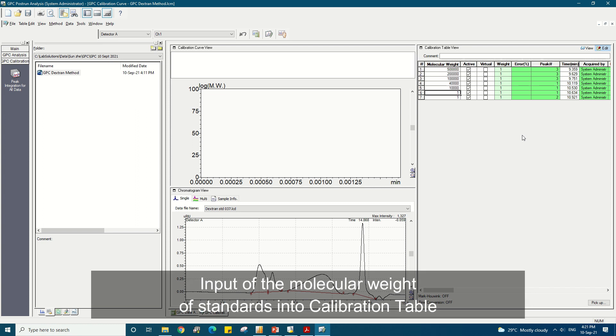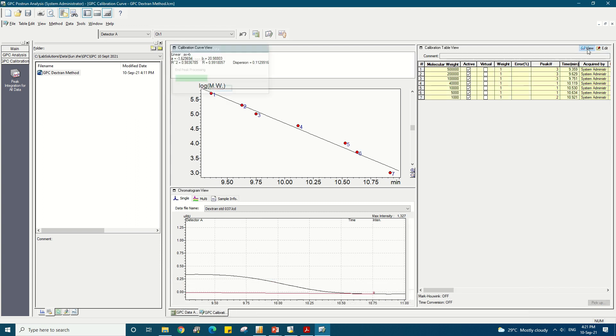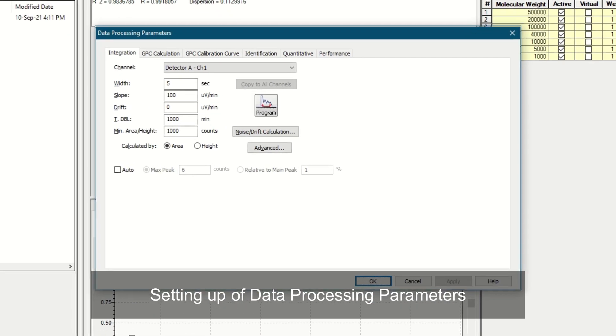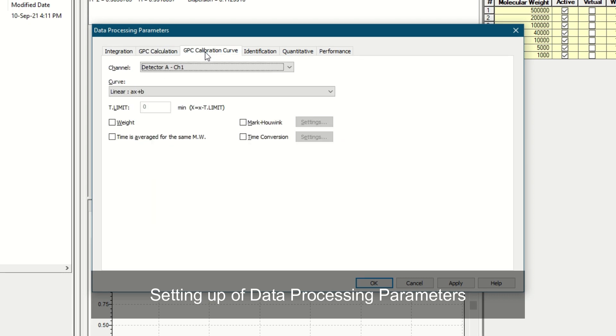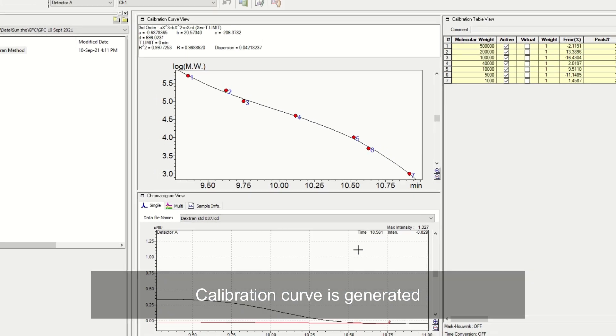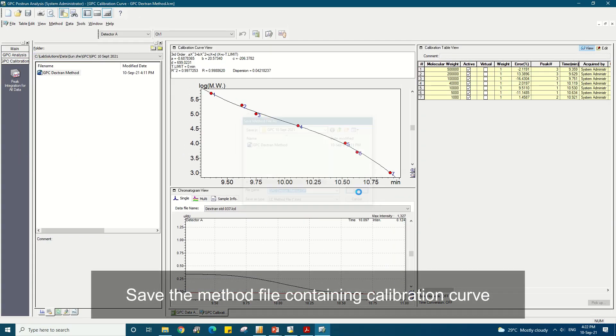The other columns of the table can be left at the default values. Once you're finished editing the calibration table, save the calibration table view parameters and start the setup of the calibration curve. Open the data processing parameters to set the parameters under the integration, GPC calculation, and GPC calibration curve tabs to generate the calibration curve. Lastly, save the method file containing the calibration curve.